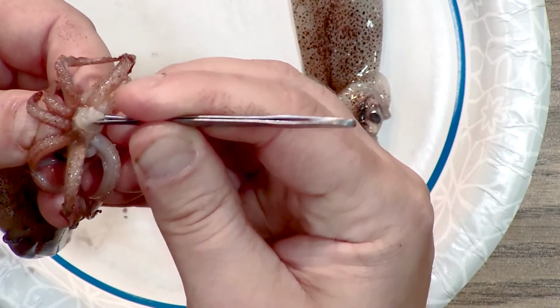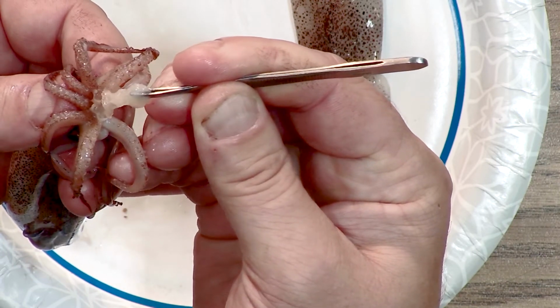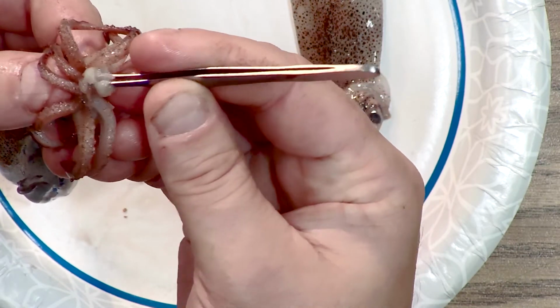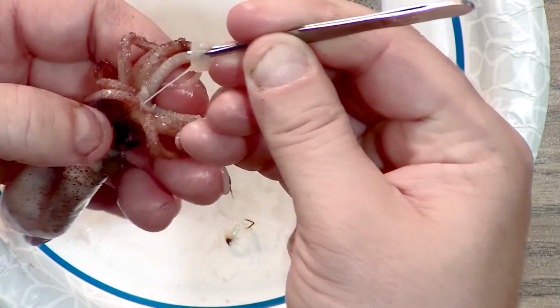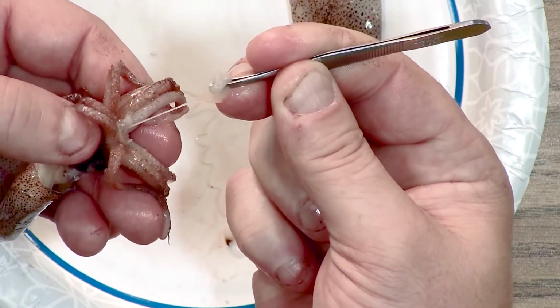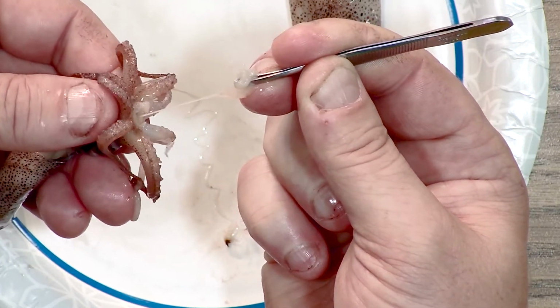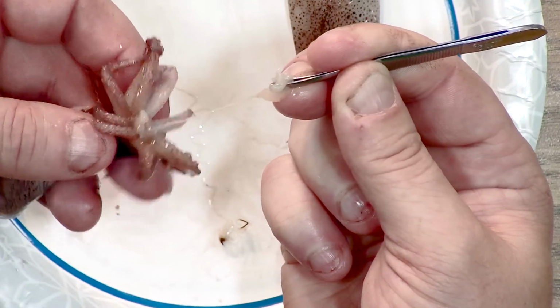Now it's kind of coming apart here, but oh, we got it. We got it. All right. And as I pull this out, this piece right here is the brain of the squid. All right. So see this white spot that's coming out? This is the brain, and there's a string attached to it. Well, just like us, our brain is attached to nerves. And this is the nerve.